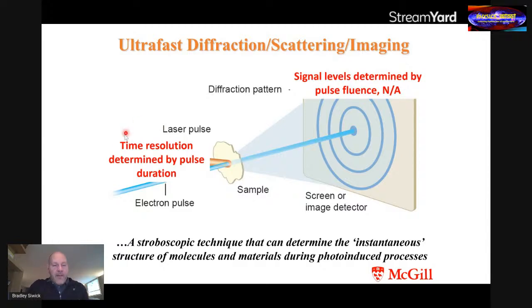But you know, an electron pulse contains a bunch, potentially millions of electrons inside of it, okay? Each one of those electrons carries a charge, okay? The electrons are mutually repelling in this bunch through a process called space charge interaction, right? And so it turns out to be not very easy to produce a short bunch of electrons due to this Coulomb repulsion that's happening inside of the electron pulse.